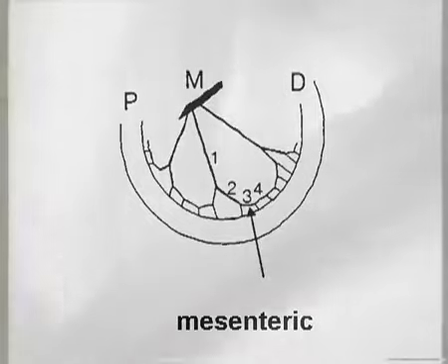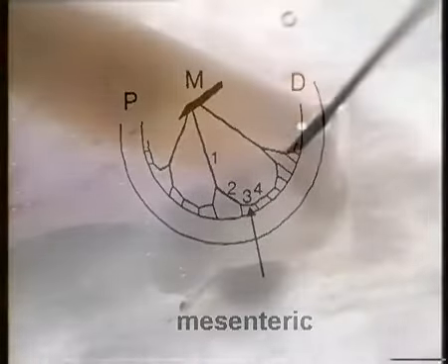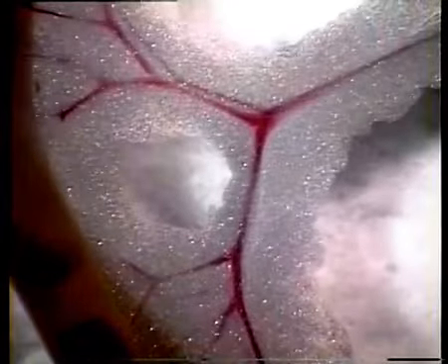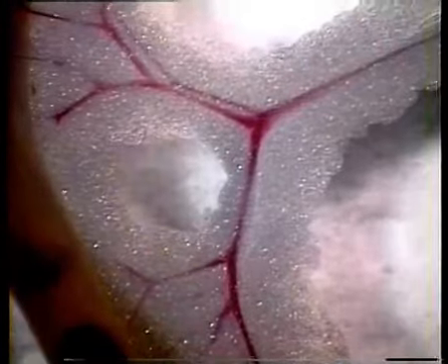We see here a rat mesenteric bed which has been pinned out in a petri dish that is coated on the bottom with a silicone compound. The tissue is immersed in cold physiological salt solution. The vein and artery run together, surrounded by a layer of fat. If you begin pinning the gut from the proximal end placed at the top of the dish and continue pinning counterclockwise, then the veins will lie on top of the arteries.